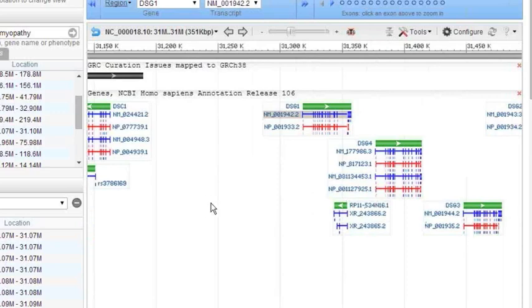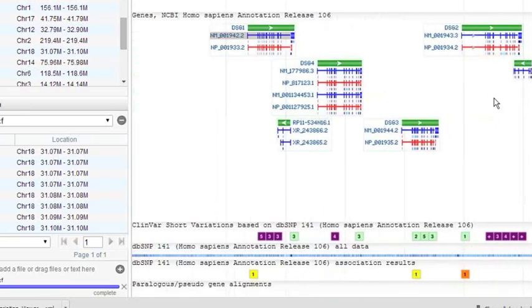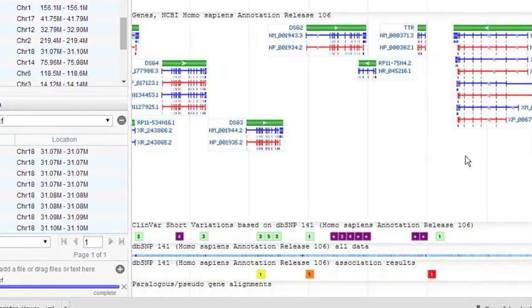Many of these genes are associated with these kinds of cardiomyopathies, and you can see there are lots of pathogenic variants in the desmoglein region as well. So far, though, we're beginning to pick up a few association results down here. They're color-coded. The redder they are, the hotter they are, the more closely they're associated with a particular phenotype. And here's one that's red. It's on a gene at the end of this. This is a gene called transthyretin.